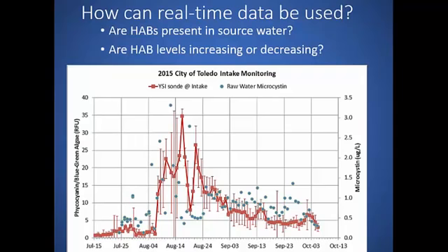And for this case here, roughly 10 RFU was 1 microgram per liter. The sonde is not measuring toxin, it's a blinky LED that correlates to the phycocyanin concentration, which correlates to cyanobacteria biomass, and Lake Erie cyanobacteria biomass correlates to microcystin. So if we can start to empower operators to see how toxin concentrations might be changing, that could help them to optimize carbon rate additions. It would help them to potentially collect additional samples if they would like to see where toxin is trending.